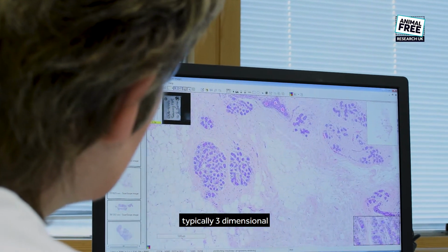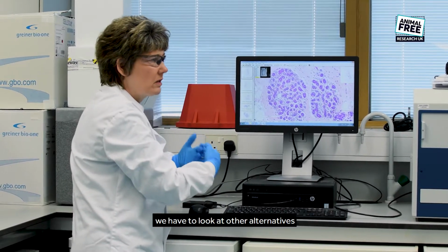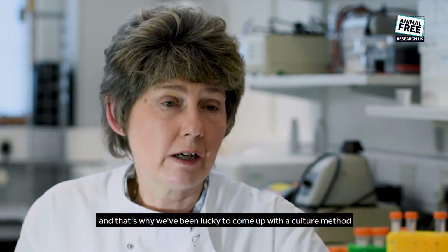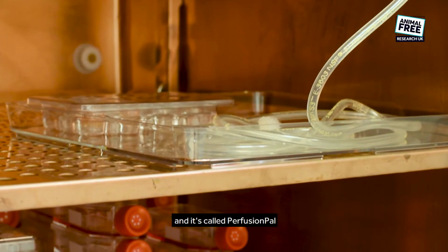Typically, three-dimensional cultures have been done using collagen. The source of collagen actually is usually from rat tails. We have to look at other alternatives to using collagen, and that's why we've been lucky to have come up with a culture method which allows us to grow the cells in 3D, and it's called Perfusion Pal.